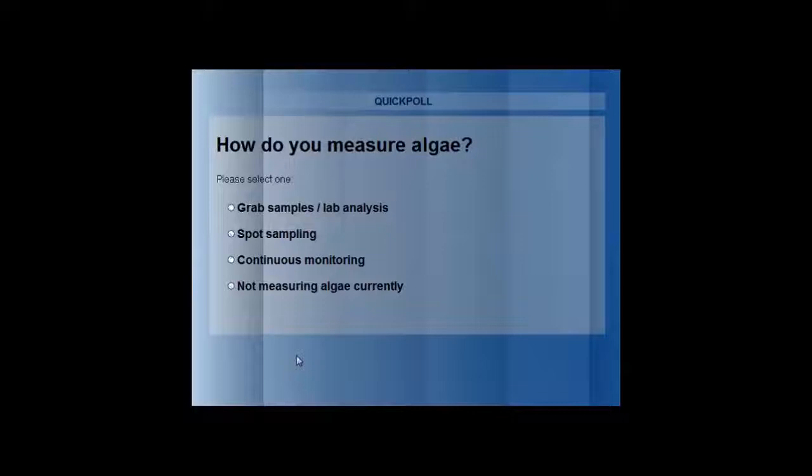Tim, we also had a question on that graph. Do you know the time scale that was the x-axis for that? Do you recall? That's a very good point. That was over about 90 days worth of data. Take that back. That's over 60 days of data collection. Sorry about that. And the y-axis was measuring, it's in percent. Well, it was scaled because I have so many parameters on there, so I just normalized it. Some of them were reading percentages, some of them were reading levels. So the signal reading was running from 0 up to about 300 at the top of the axis. And I'll have that data set continued through this webinar.